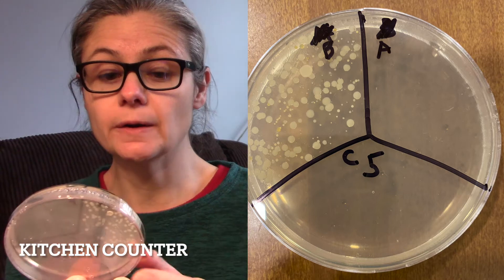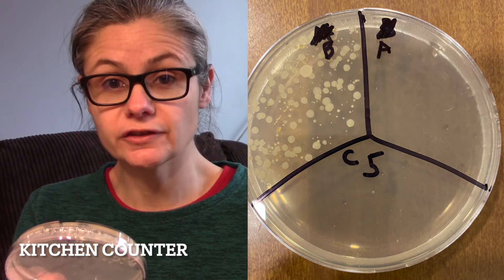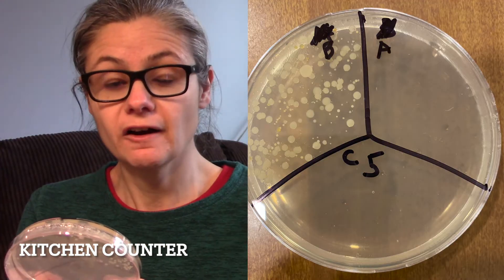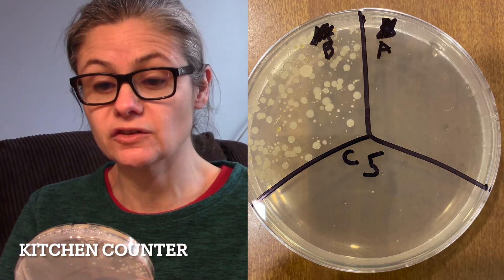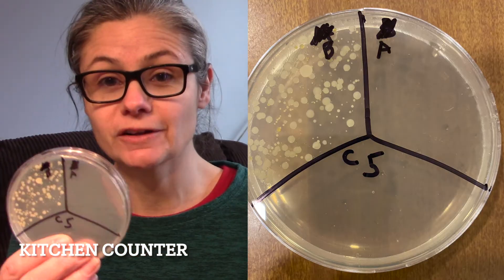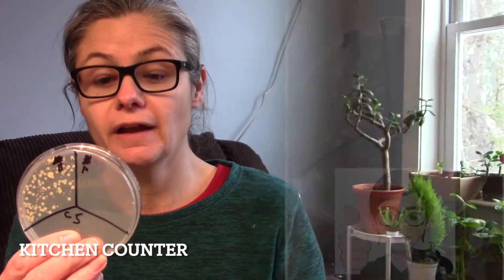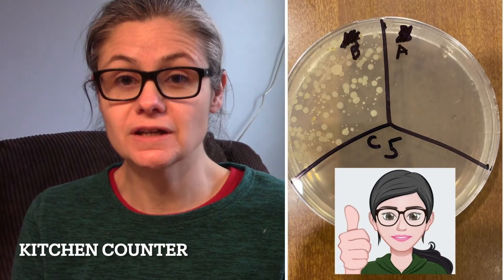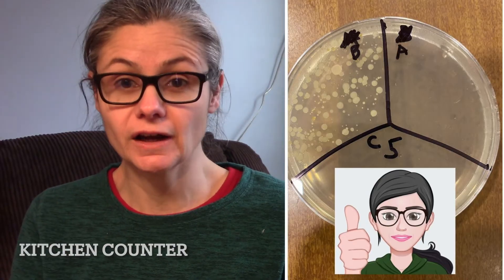The kitchen counter. In B for before, we have a variety of different bacteria growing — some big ones, small ones, yellow ones, white ones, lots of variety. And in A for after, I got nothing. I can't see any bacterial colonies at all. So I would say Dr. Bronner's is extremely efficient at disinfecting my kitchen counter.